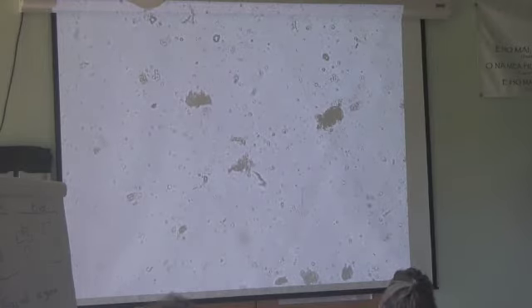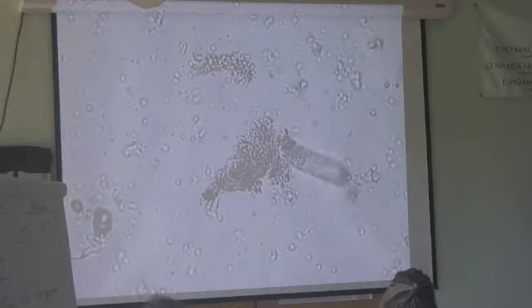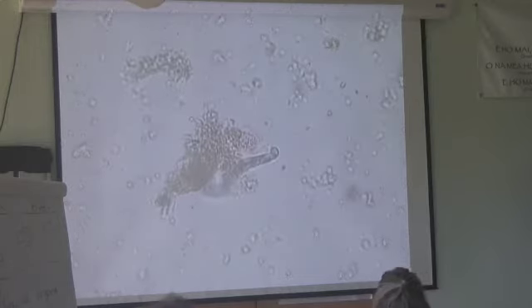So it might be a little easier to see, so let's go up in the bag. Remember the glues the bacteria make? His tail is stuck in some of that glue. It's like a weird thing in here. Yeah, that's why he's scratching it. He's trying to get out.